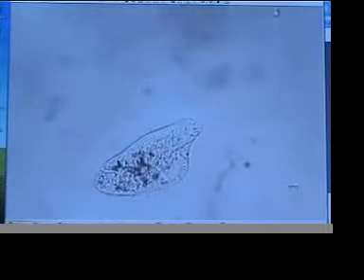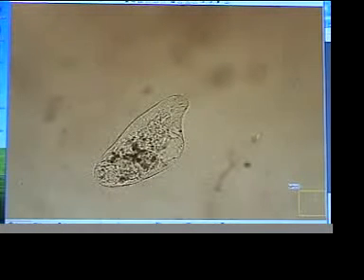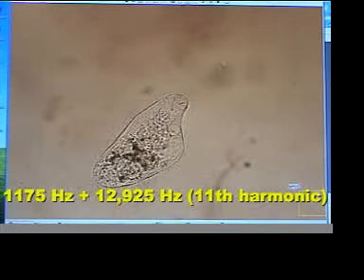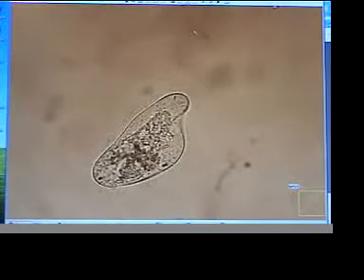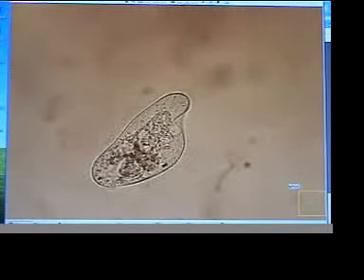Here we have a paramecium undergoing a shape change. Change the lighting a little bit. This was a paramecium being hit with two frequencies, 1175 hertz, and the 11th harmonic, 12,925 hertz. And we are seeing tremendous shape change here. We'll work with the focus a little bit so you can see that. Watch it carefully and see if any more shape changes occur.